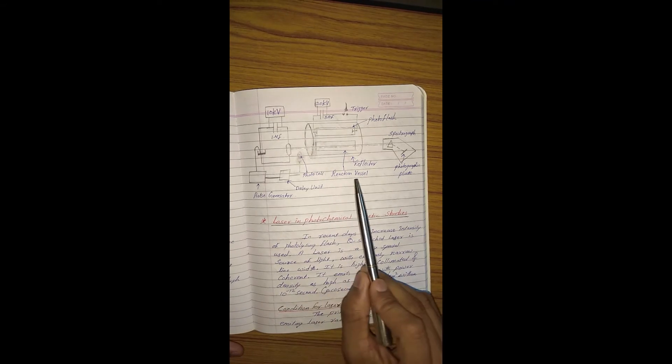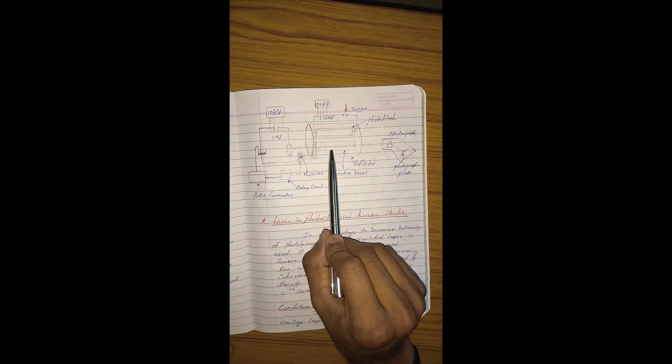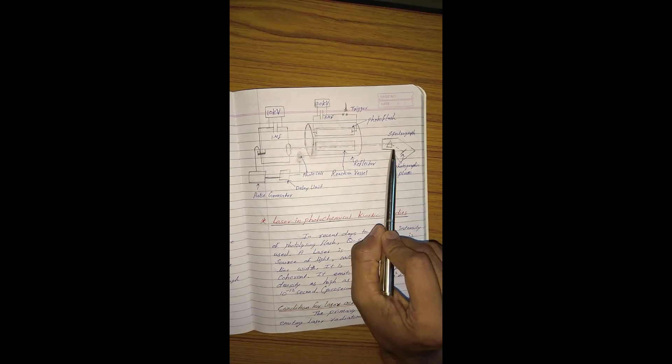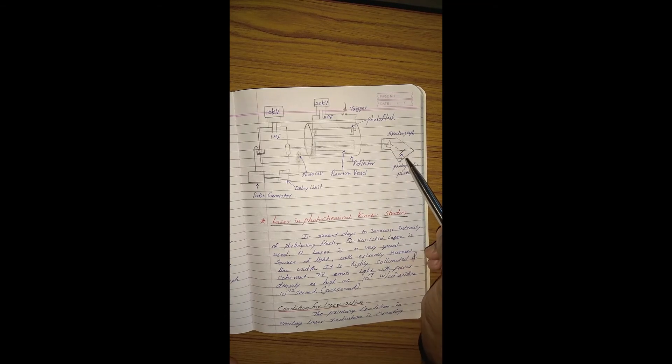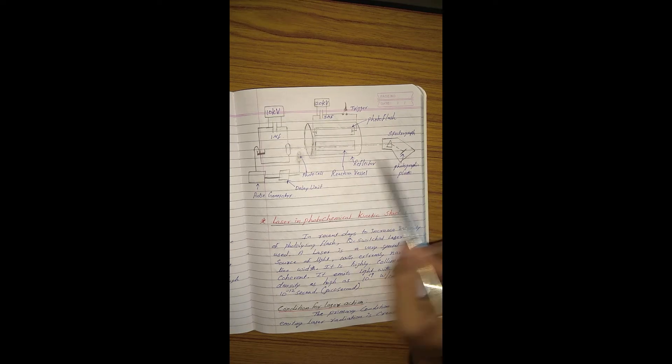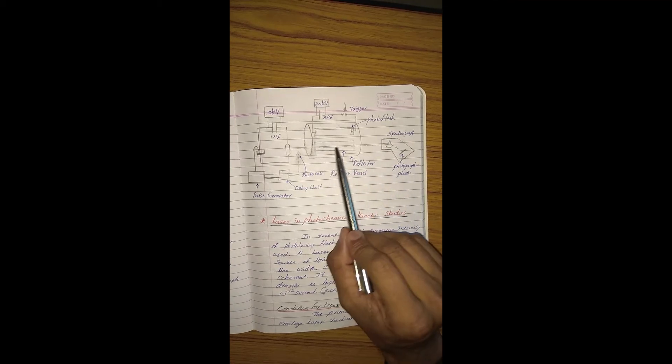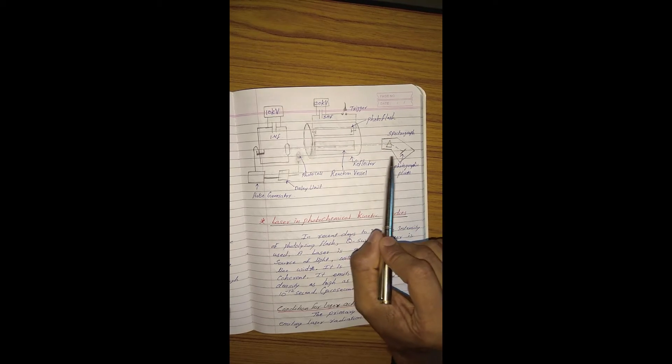The light from the monitoring flash is passed through the reaction cell and then through a spectrograph to obtain the absorption spectra. This gives the concentration of intermediates formed, and using this we can learn the quantity of intermediate formed during this process. This method is called flash photolysis.